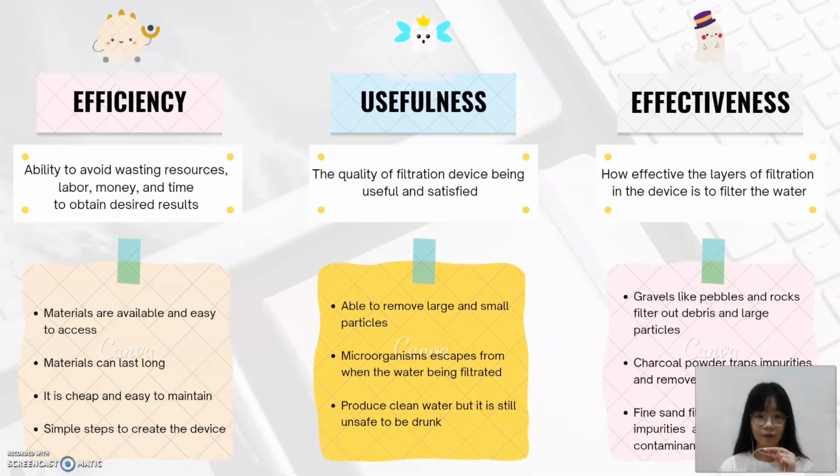However, some of the microorganisms will escape when the water is being filtered. Therefore, we can conclude that our device can produce clean water, but it is still unsafe to drink because not all the microorganisms will be killed during the filtration process.